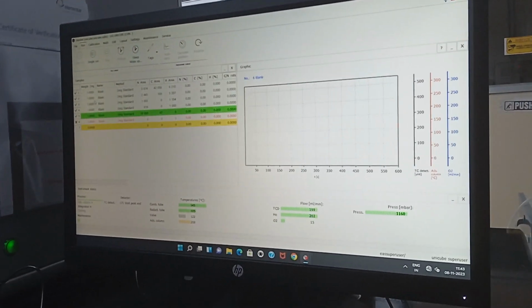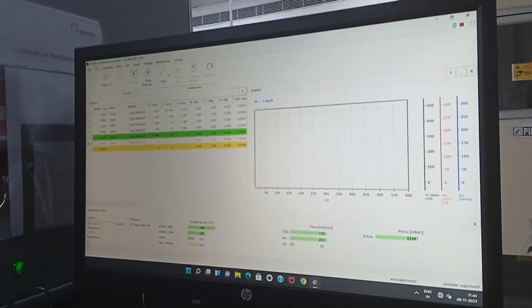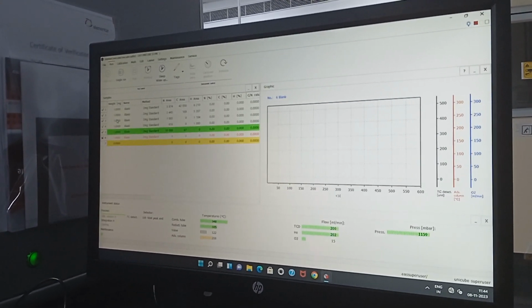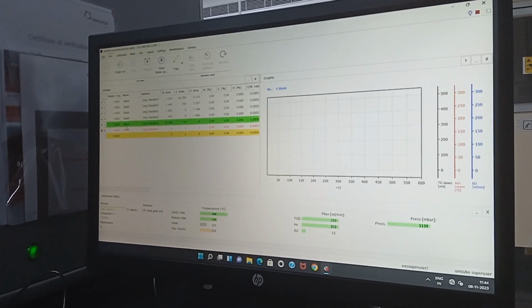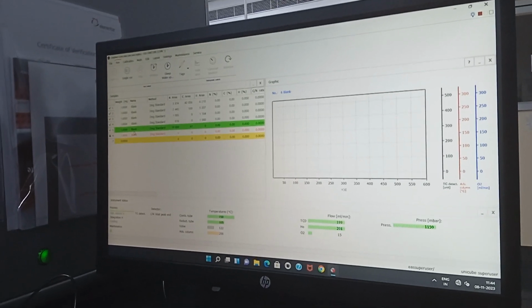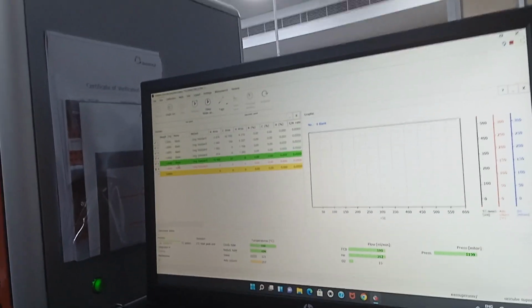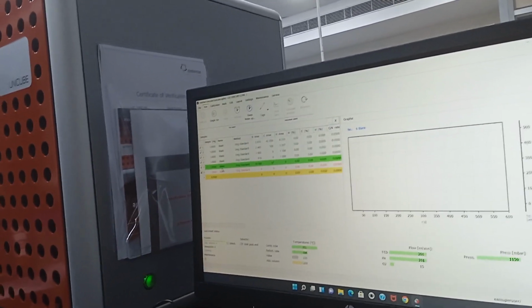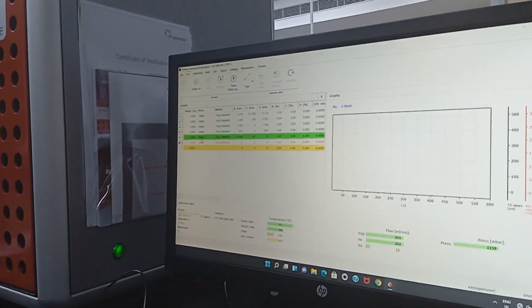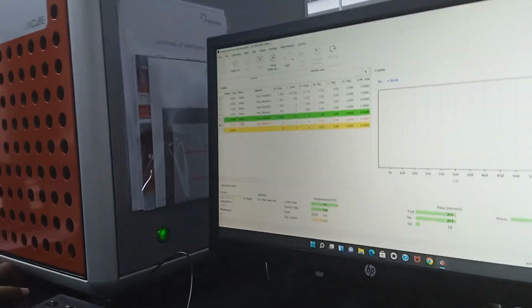In this one you can see the view with respect to the samples. Here you are putting the weight of your sample and the name of your sample. It can be anything, for your identification. Is there a limit on the weight? If you are putting a soil sample, maximum 5 to 10 mg. For CHN, 5 to 10 mg is enough. This is the weighing machine.